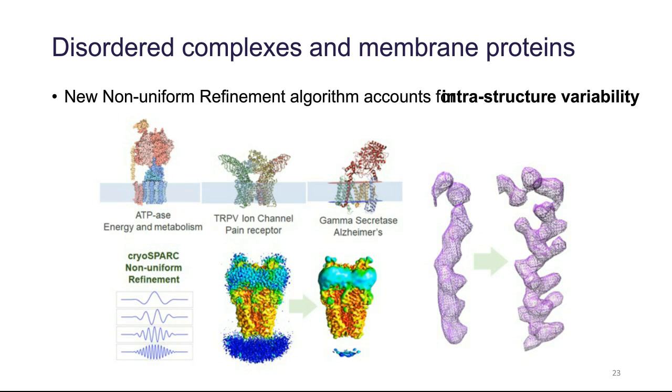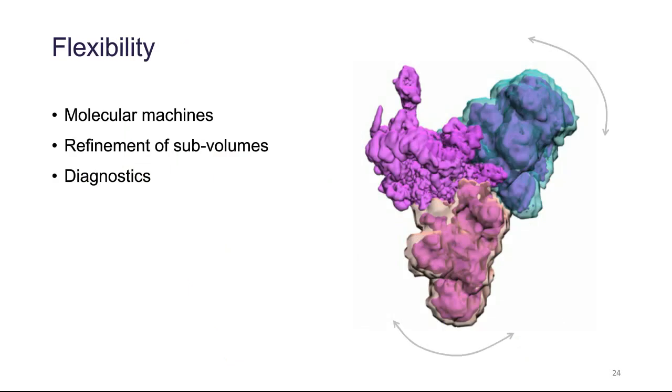Along with disorder, flexibility in protein molecules is very common. In fact, almost all proteins are molecular machines that have moving, bending, and rotating parts that work together to mediate a biological process in the cell. With the basic iterative refinement algorithm I mentioned earlier, flexibility is a severe limitation. Particle images of flexible molecules will not coherently average together at high resolutions. Instead, details are blurred out by the flexing of the molecule. Dealing with flexibility is an open area of research today.